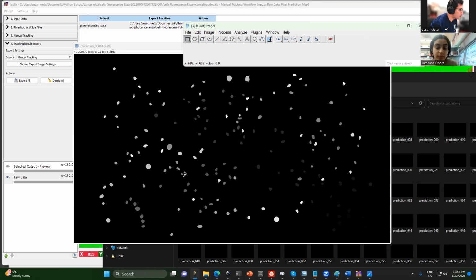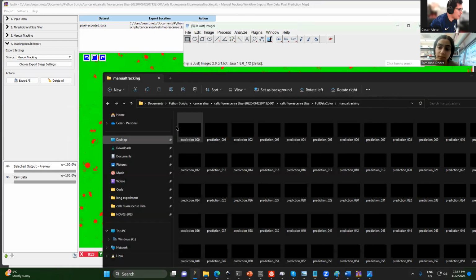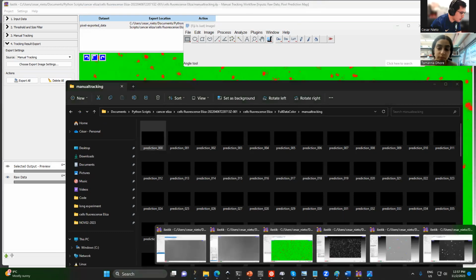And I think you can use these files. So with this file, you can check the program. I'm not sure if it's a TIFF sequence or just a TIFF. Maybe you can, well, let's see what this does.